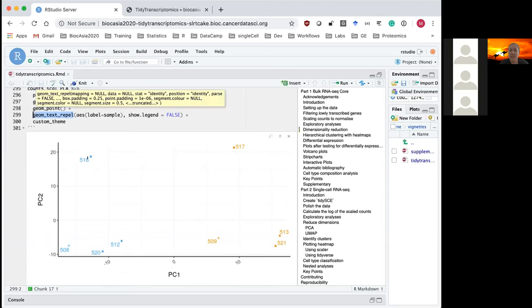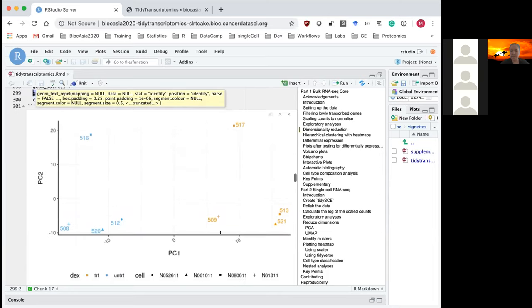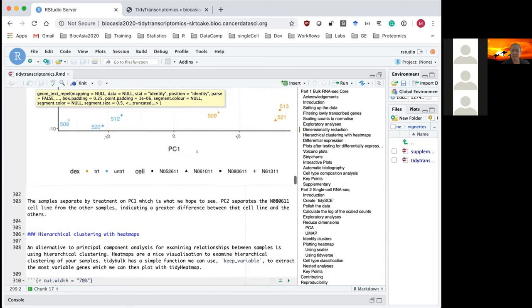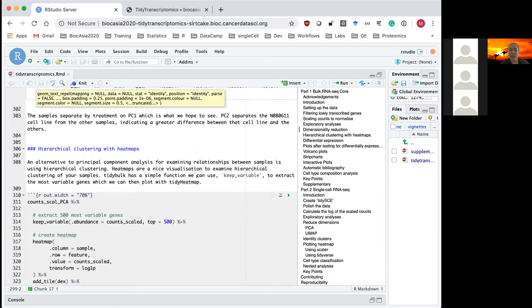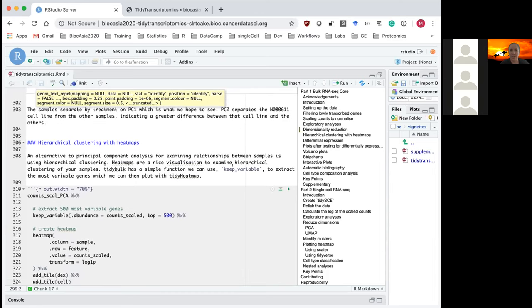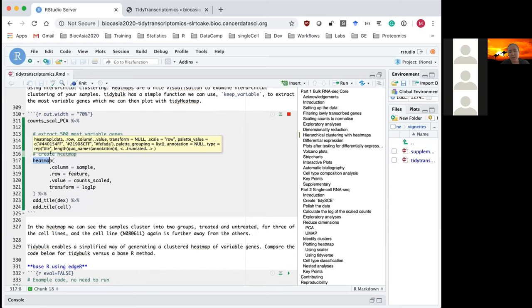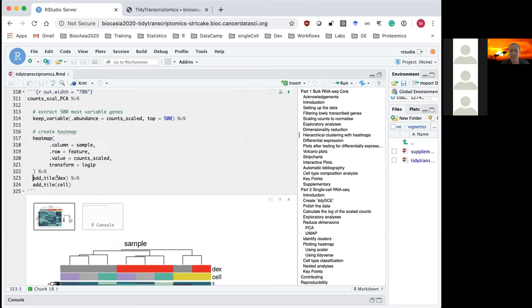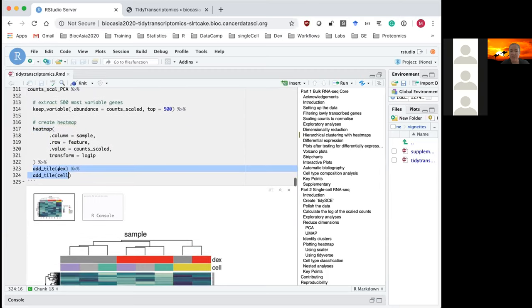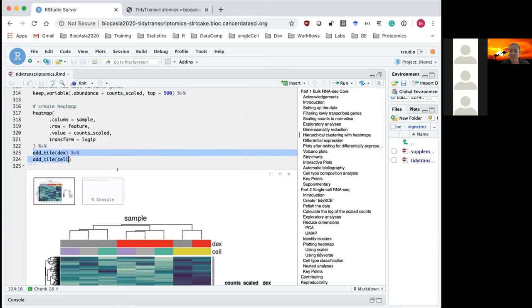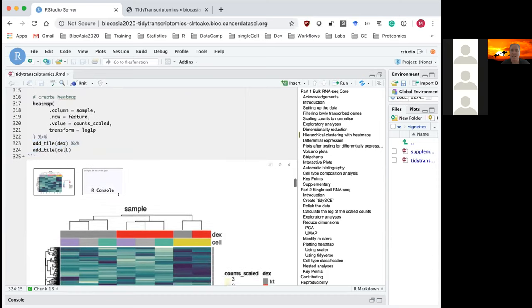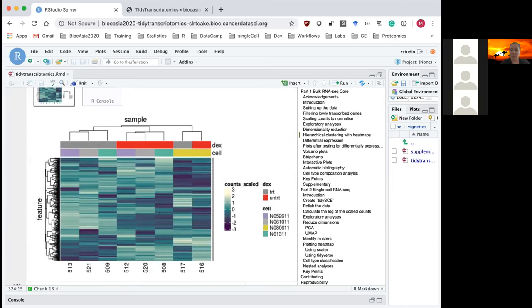The resulting PCA plot shows our samples separating nicely into treated and untreated groups, with shape indicating which cell line each sample is from. We can see one cell line — the square — is a bit different from the others. Another method to examine relationships between samples is hierarchical clustering using heatmaps. tidybulk provides keep_variable to keep the most variable genes across samples — for example, the top 500 — which we can pipe into the tidyheatmap package and use add_tile to add treatment and cell line annotations. The result again shows eight samples separating by treatment, with one cell line different from the others.